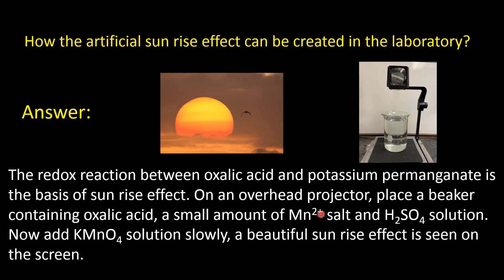On an overhead projector, place a beaker containing oxalic acid, a small amount of manganese salt, and sulfuric acid solution. Now add potassium permanganate solution slowly, and a beautiful sunrise effect is seen on the screen. You can practice it in your chemistry lab.